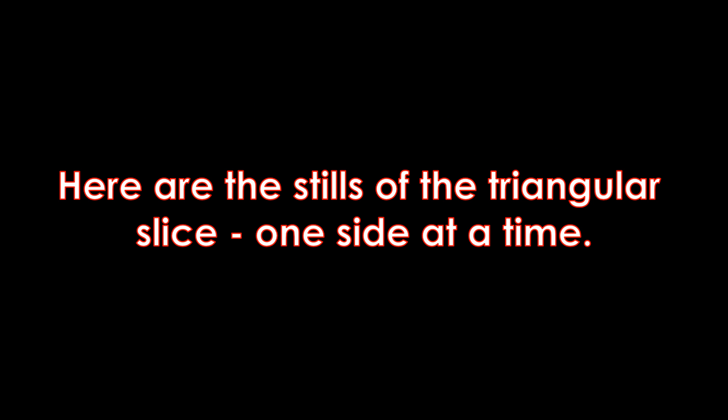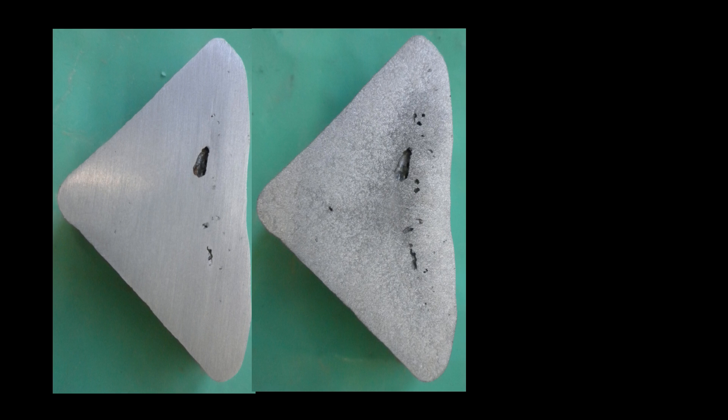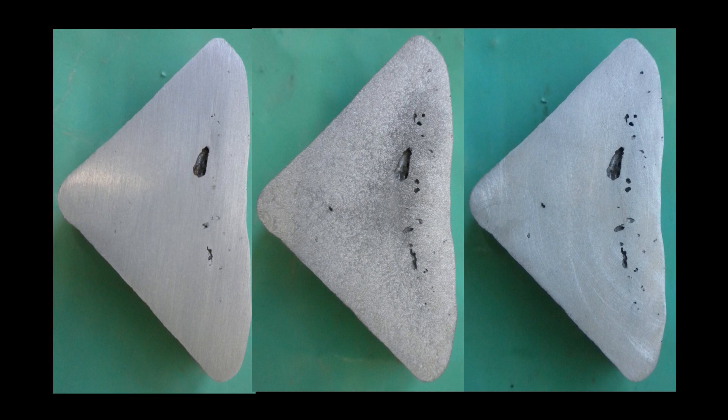Here are some stills of the triangular slice, one side at a time. First we have the sample as sanded, you can see most of the coarse porosity but not really all that much of the fine stuff. Now we have the sample etched and the porosity is beginning to be revealed a bit more but it's partially covered by the etch.